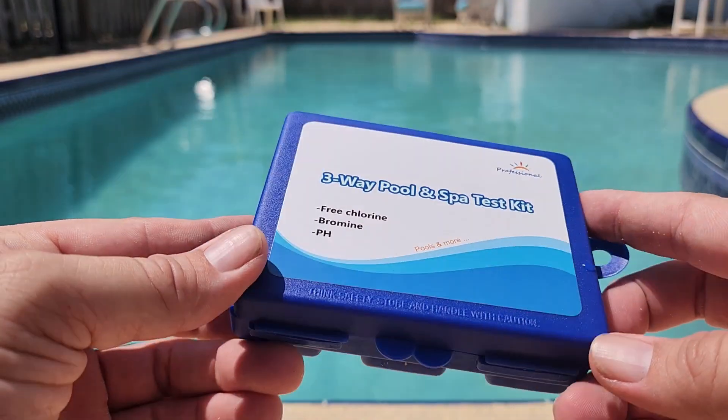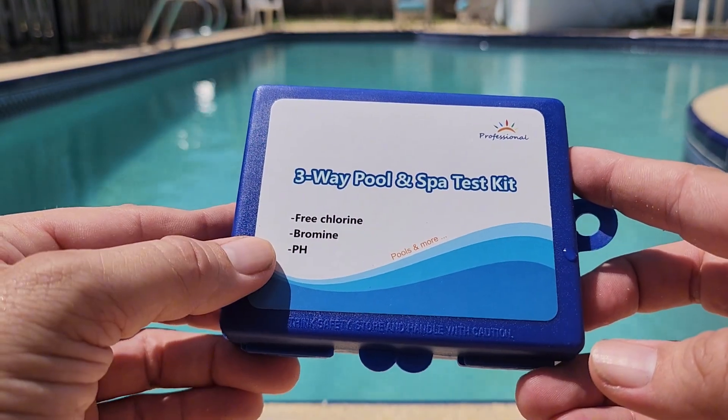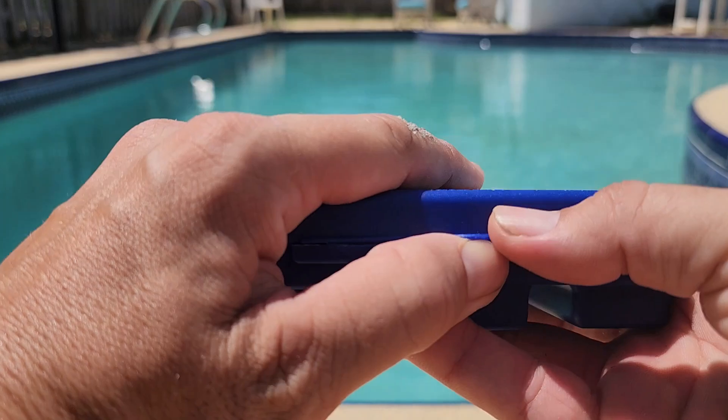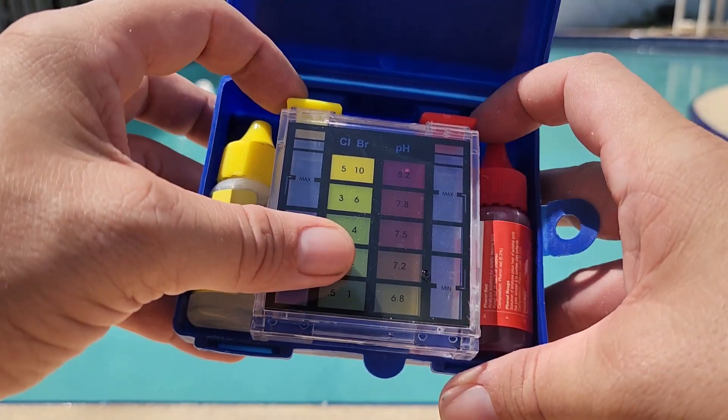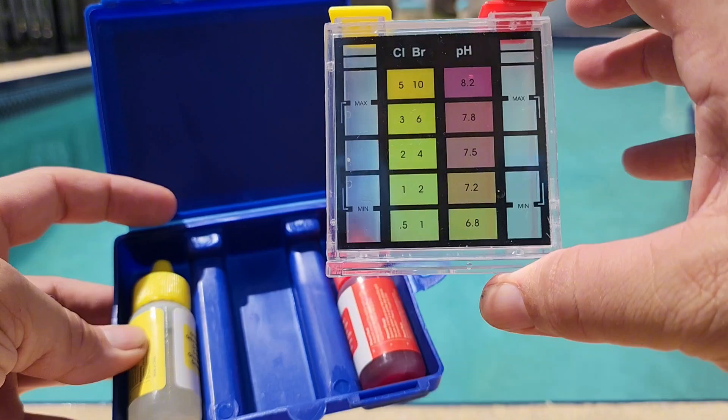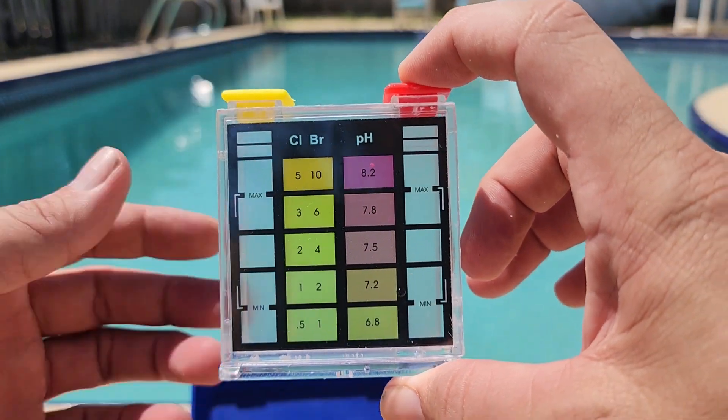I want to show you this three-way pool and spa test kit. This is a chlorine, bromine, and pH test kit, and it's one of those little drop test kits. We've got a yellow and a red set of drops, and that'll be the left and right side of this kit.